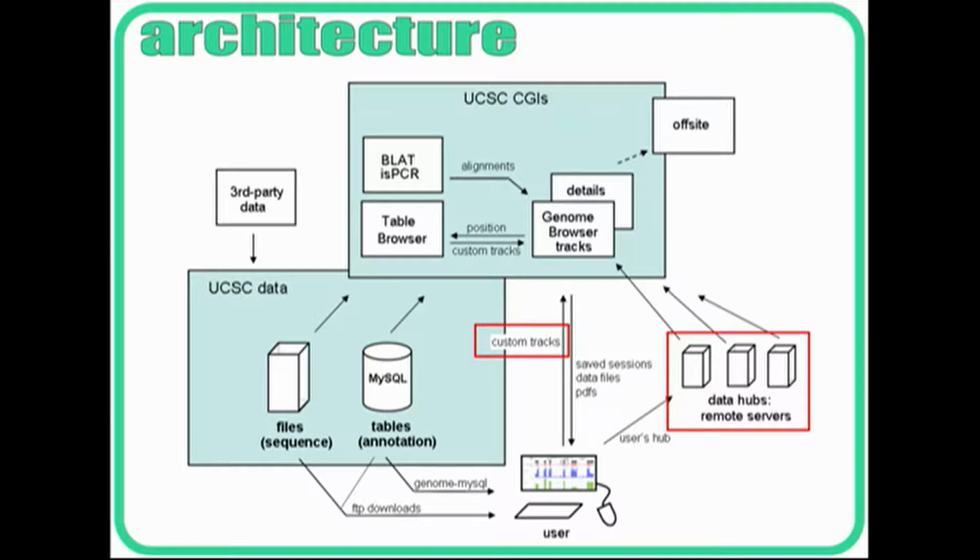I've seen a bunch of pictures of IGV. They seem to have captured the right-off-the-sequencer space. So a lot of people get the sequences off of their sequencer and put them into IGV. Your BAM files and your VCF files are also loadable into the Genome Browser, where they're visualizable and also intersectable. So you can intersect them with all of our other data. So you can say, okay, here are all my variants. Which ones of them are also common in the genome? And so you can get a visual view of the ones that are common or the ones that are left over when you subtract the common ones. You can see the ones that are left.